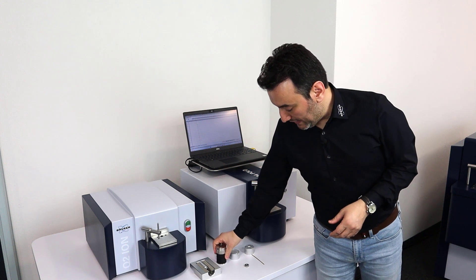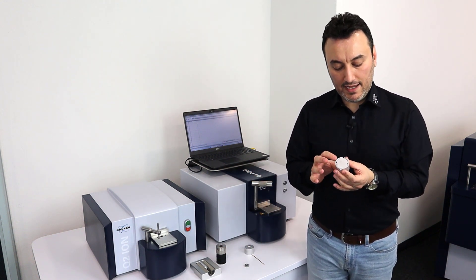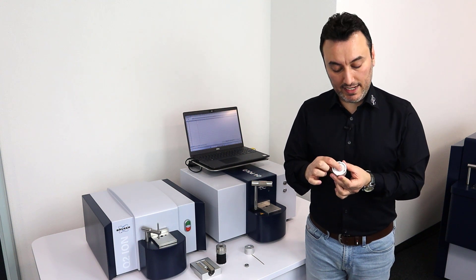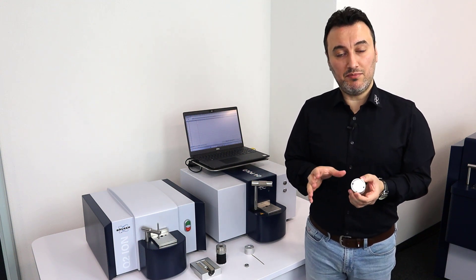The third adapter is the small sample adapter. It has a spring inside which provides the downforce to keep the sample in place during the analysis.